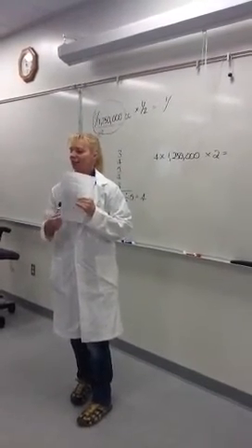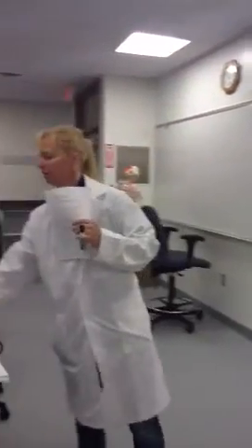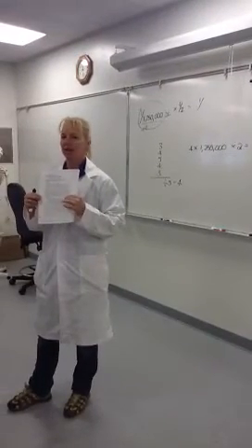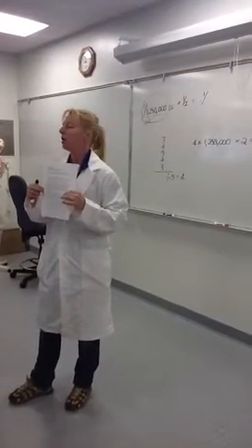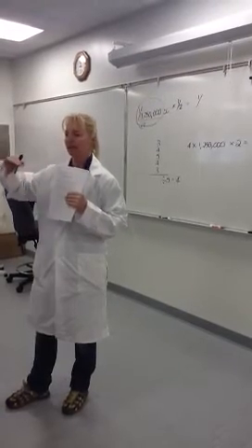With this one, you can get the results fairly quickly. With this one, you get the results a couple days later. So it's not necessarily real useful to you at that point in time. But what that other activity does is it allows you to see the exponential growth.